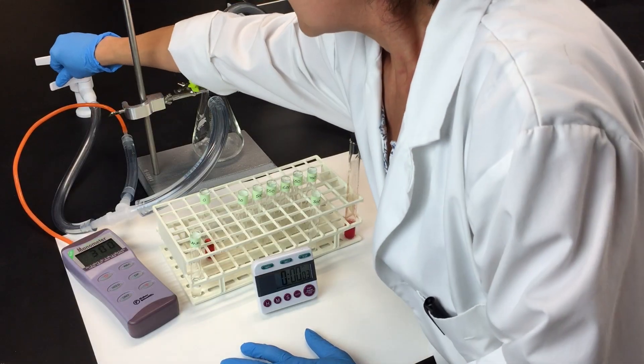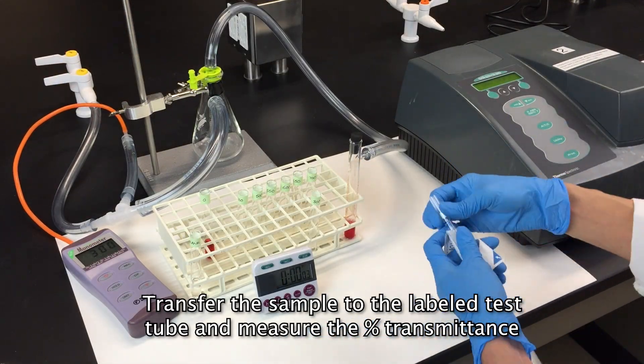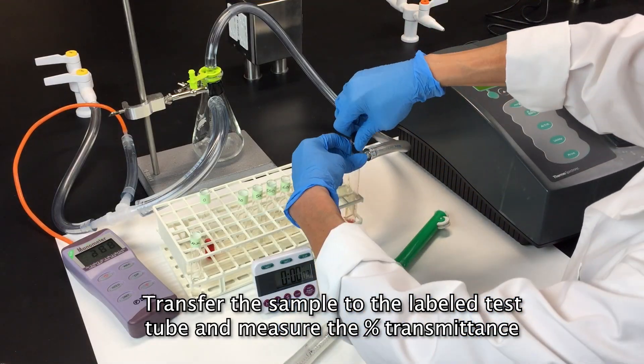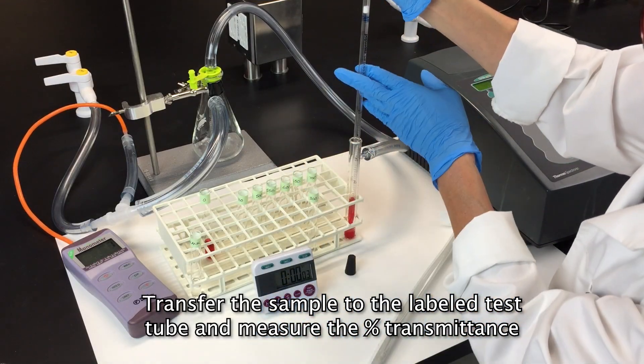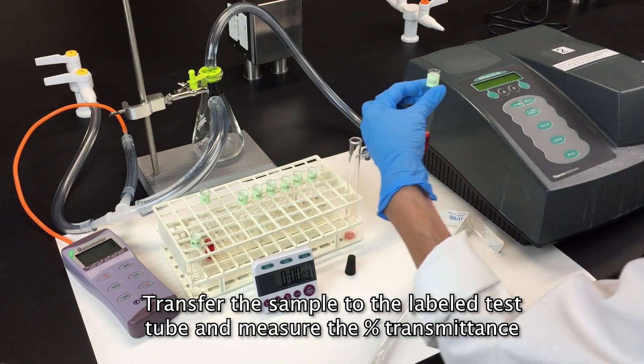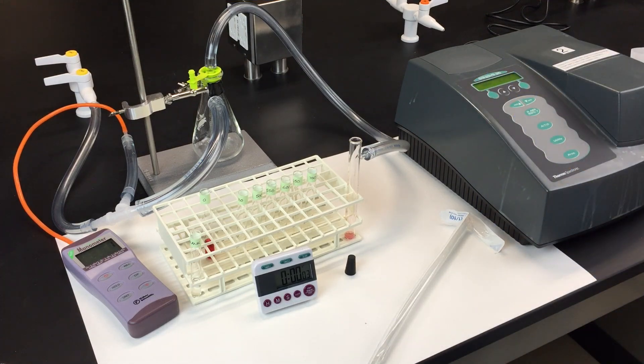Turn off the vacuum and transfer the hemolysate to the 300 millimeter mercury tube. Wipe off your tube and place it in the spectrophotometer and take your reading.